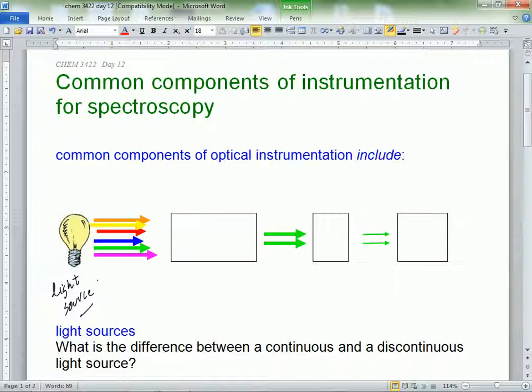But if you want to have an automated machine where you can let all these different wavelengths out, because remember, how do you get an absorbance spectrum? It's what versus what? Absorbance versus, well, concentration would be a calibration curve. Wavelength, right? So you have all these different wavelengths, and then you get some blob or something. So the absorbance changes with wavelength. If you want to get that, just think of all the bloody filters you'd have to have, because you have to monitor how things are absorbing at all these different wavelengths. You'd be popping in filters all the time. So no, they're not going to use filters.